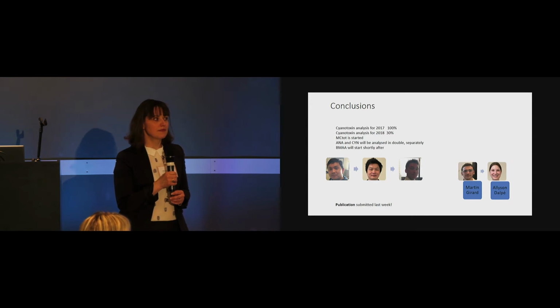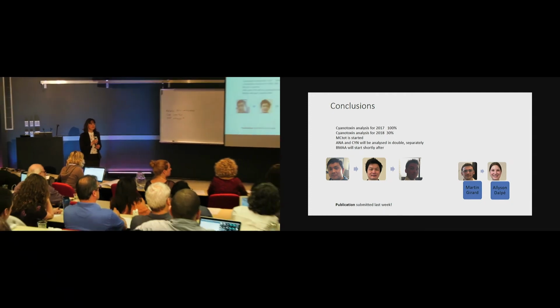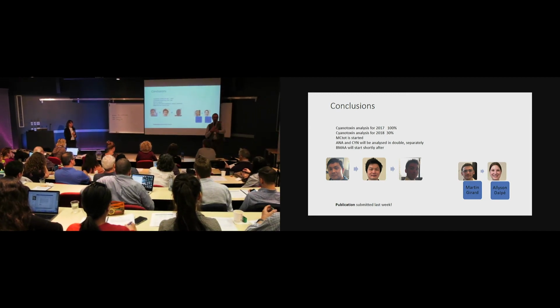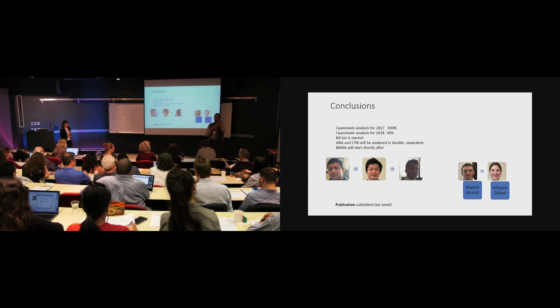The objective, I mean, there's been a lot of comparison between ELISA and MS, and most of them showed that at low concentration, there's a lot of false positives and false negatives. So we will do a comparison with some selected samples to have that data for ourselves, but we know what it's going to say. The trick becomes really at the low detection range, because at high concentration, we see high concentration, it doesn't matter.